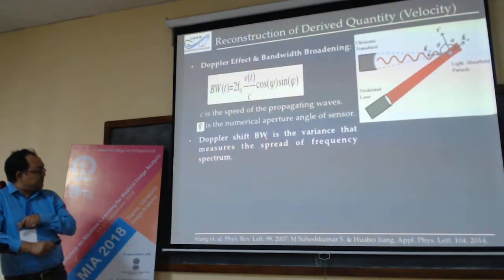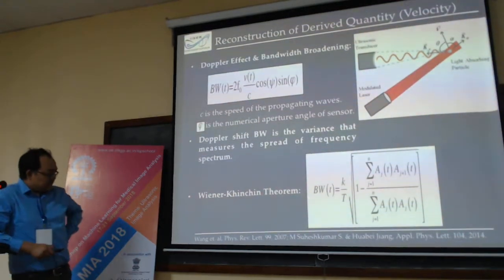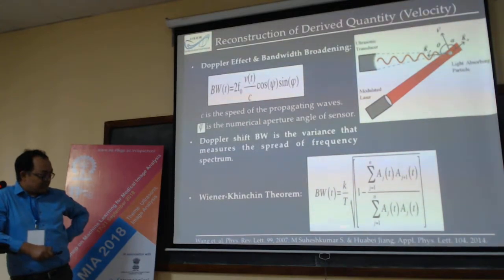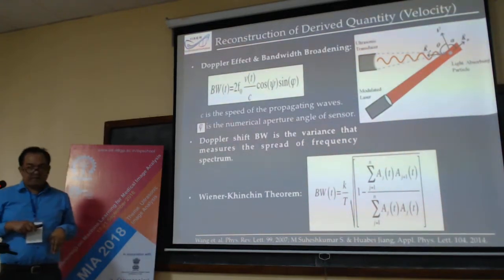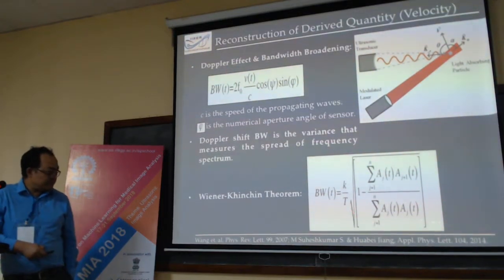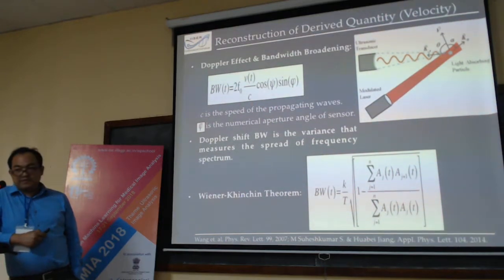We can interpret this as the variations of the frequency spectrum. If this is the case, from this theorem, it is given by this, which is the correlation of the sequence of nearby signals. In our case, I think we did it for 5 to 10 consecutive signals. Then we do this kind of operation, and then we got this. In the sense that from the experimental measurement of this left-hand side, we can get this. Here we can estimate the side.